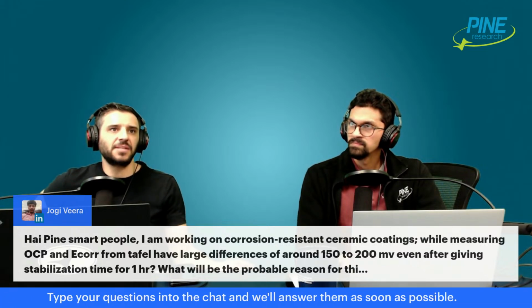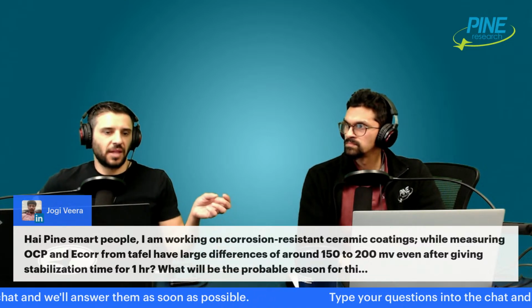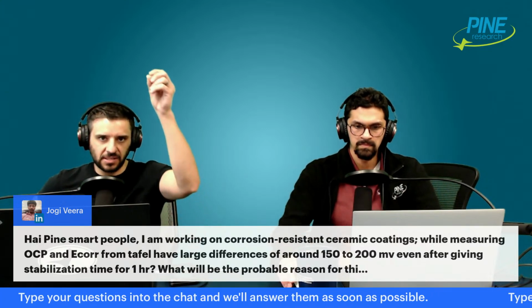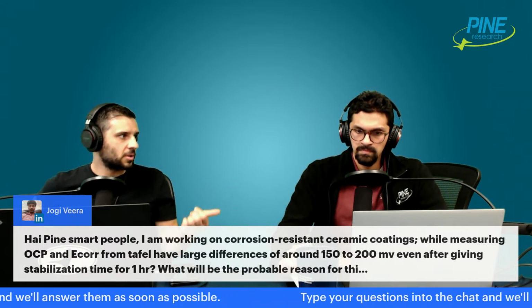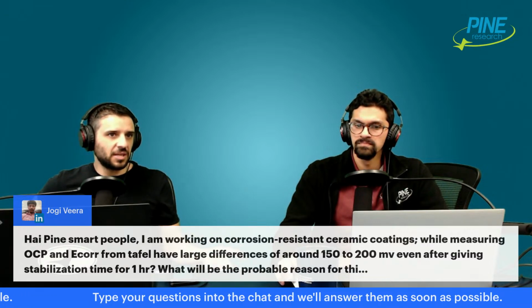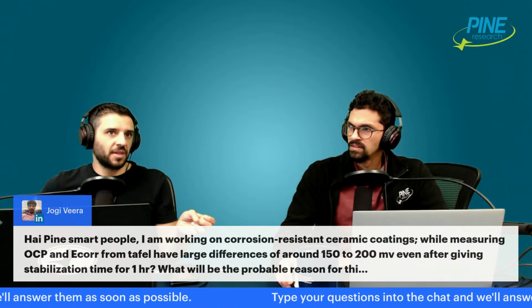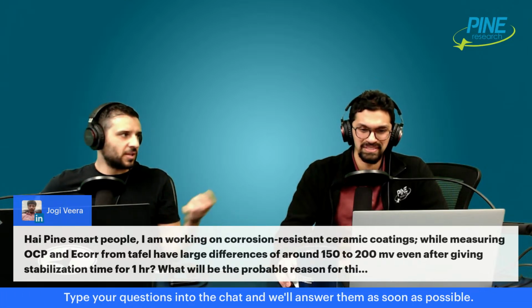I think practically what we have is the situation where we start at OCP with our potentiostat, and we polarize positively and then we polarize negatively, and we get the Tafel plots just as you described with the slow scan. But there's nothing fundamentally or thermodynamically that necessitates OCP and Ecorr being the same. I think that was your point, right? I'm in the same boat as you.